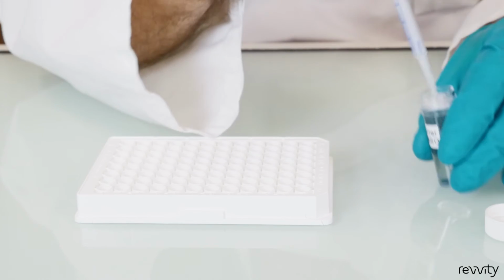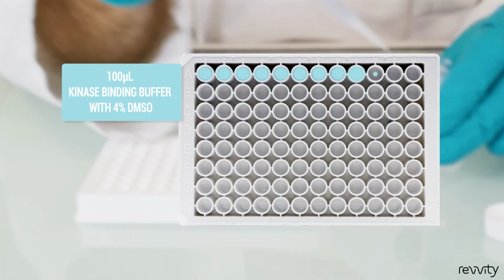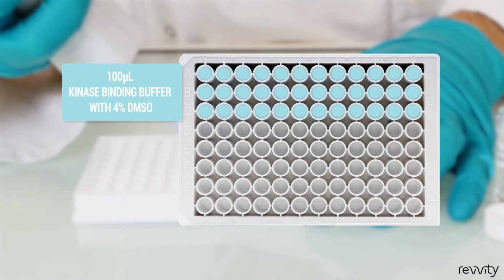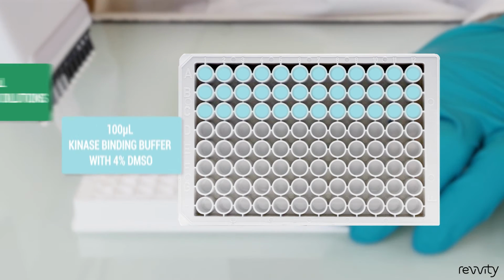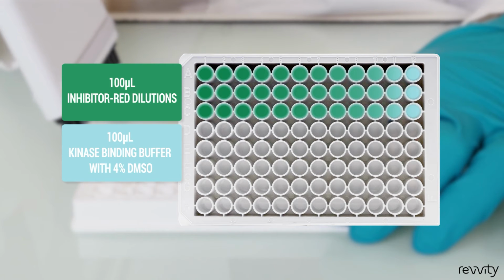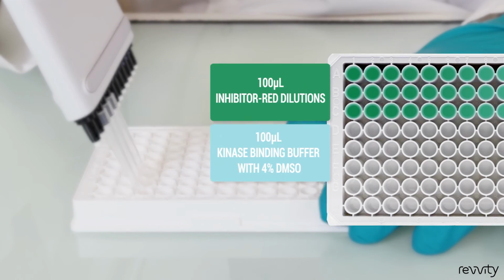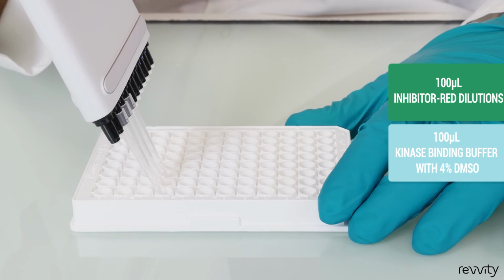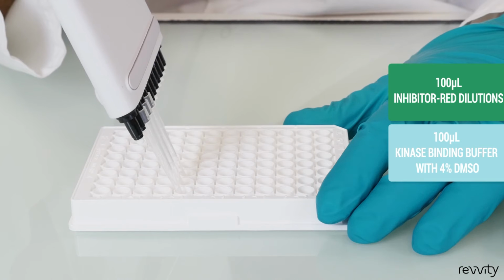Prepare half-serial dilutions of each inhibitor red. Start by dispensing 100 microliters of kinase binding buffer with 4% DMSO. Then add 100 microliters of inhibitor red dilution at 1 micromolar. Mix gently and repeat the half-serial dilutions to prepare the following inhibitor red working solutions. Don't forget to prepare an additional negative control that only contains kinase binding buffer with 4% DMSO.